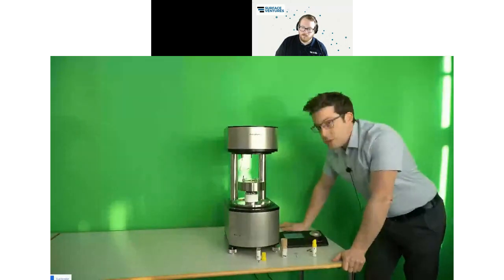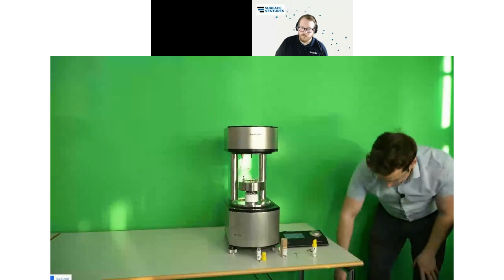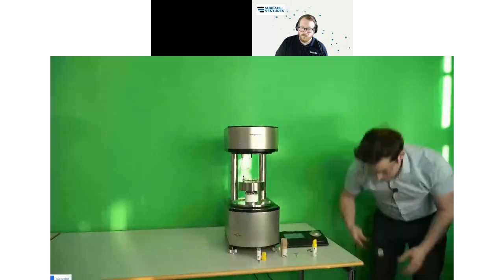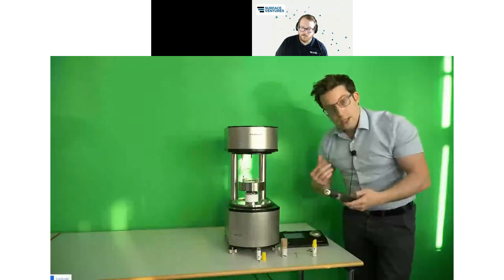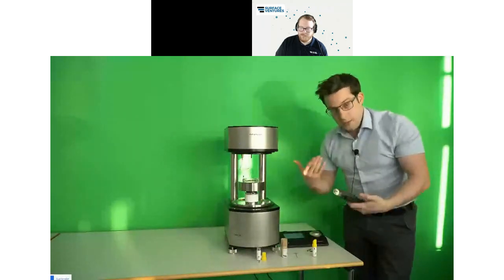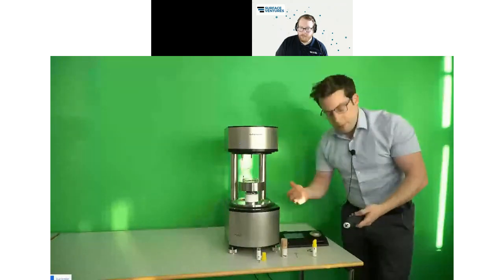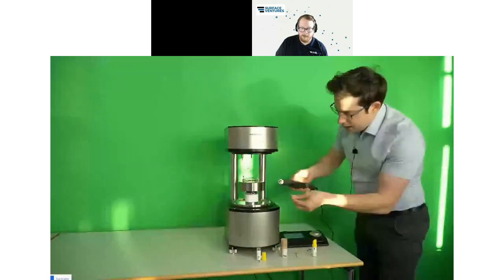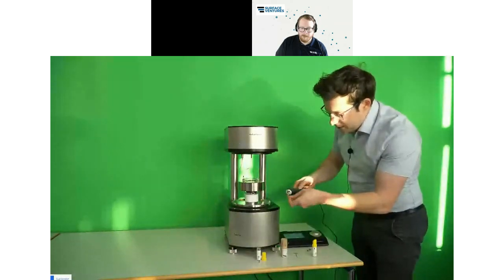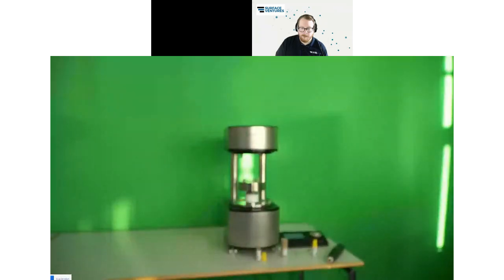So what the tooth doctor will do to activate it before use and put it in the customer's mouth, he will use this kind of plasma treatment system. Inside his office, he will do it directly before implanting, because plasma effects are often short-time effects. He will take his implants, take this kind of plasma device, and then treat the surface. So I zoom a little bit in with the camera, because this looks really nice when the surface gets treated.